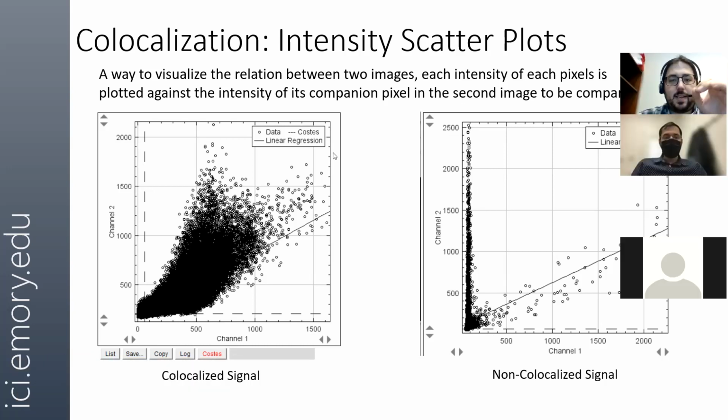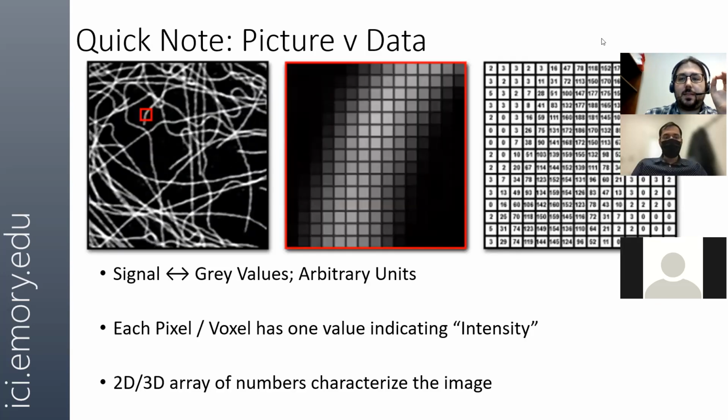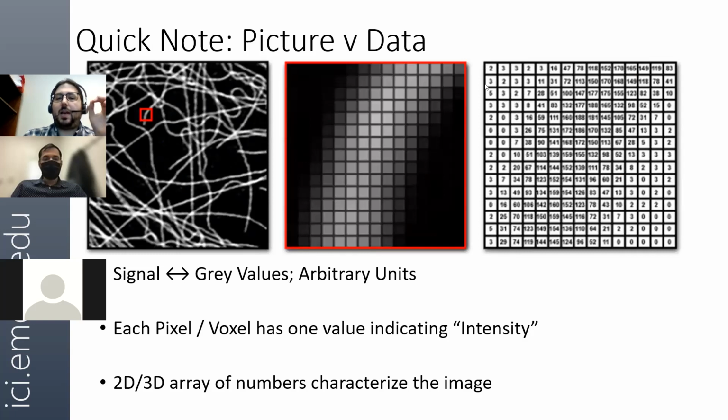And when I say that these 2 pixels are compared by intensity, we're always saying that for each image, pixel by pixel, it's compared position-wise, which means if we go back here, you have, say, 2 sets of data that you want to check for co-localization.